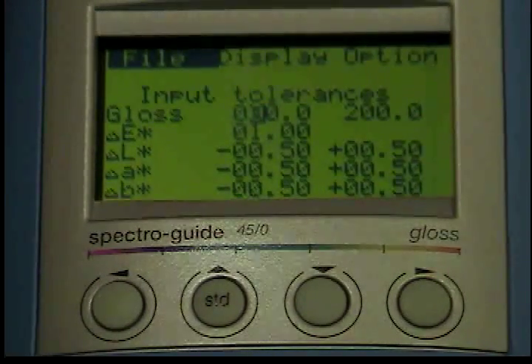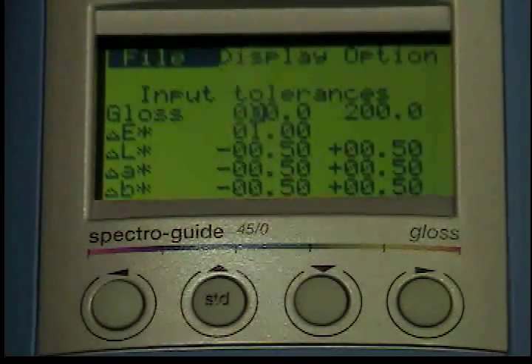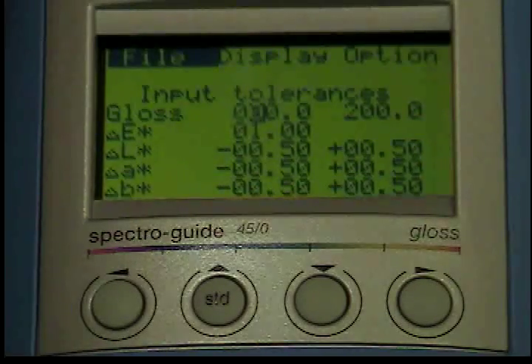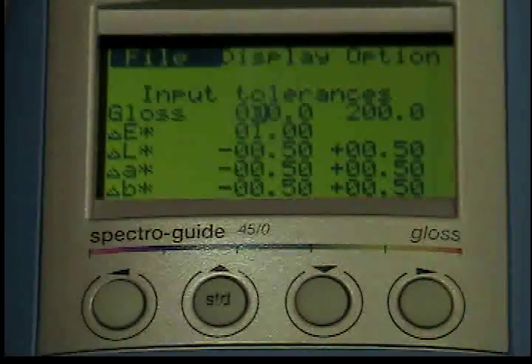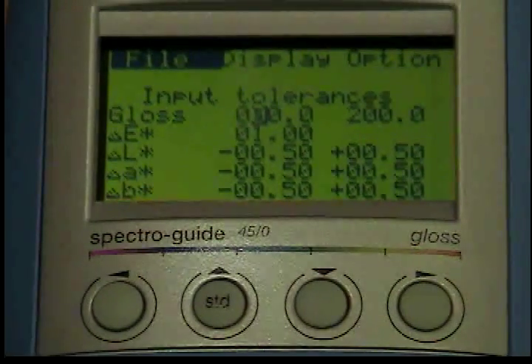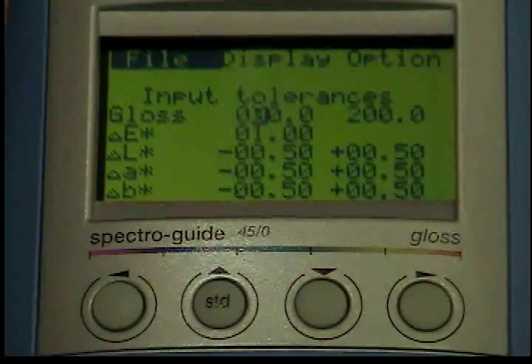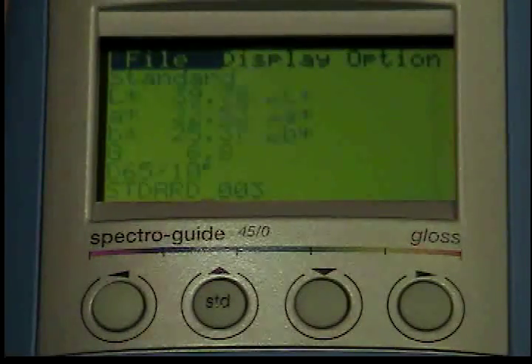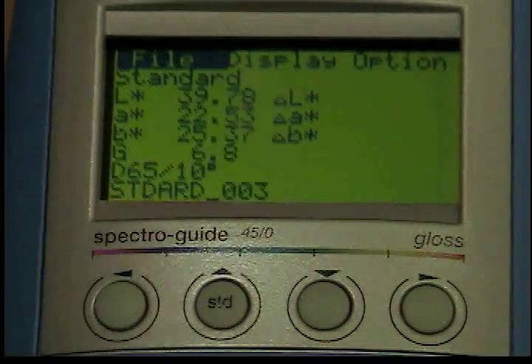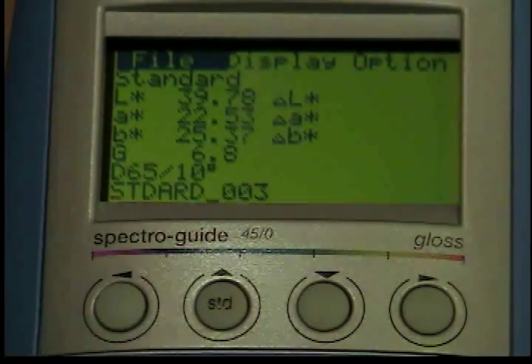The input tolerances menu will now appear. Enter the appropriate values in the manner described above, then press the operate button. The instrument will now return to the previous measurement mode.